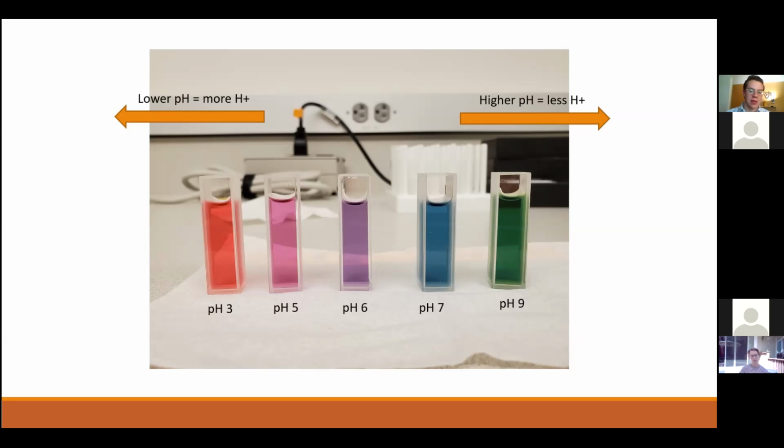It'd be nice to have some data to go with it that would say, yes, this is in fact what we observe. And to get such data, the instrument that can give us that data will give it to us in absorption. So it'll shoot some light through one of these vials, a bunch of different wavelengths, and it'll tell me which wavelength one of these vials absorbs at.